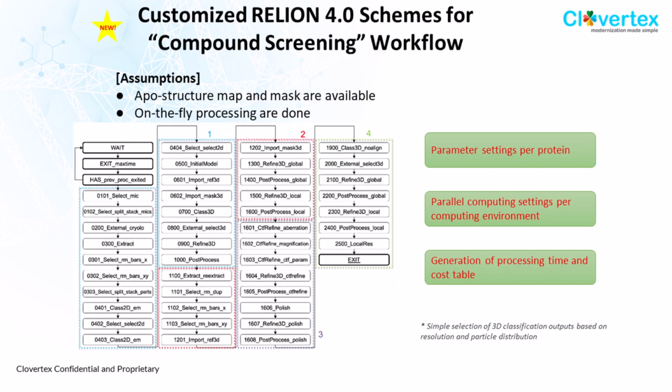Next, please. To expand this, we also made a customized Relion 4 scheme for a compound screening workflow. Compound screening means that for structure-based drug design, abbreviated SBDD, you want to get structures of about hundreds of compounds bound to the target protein.